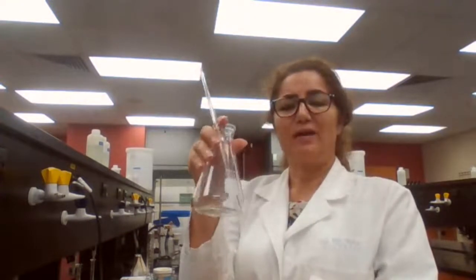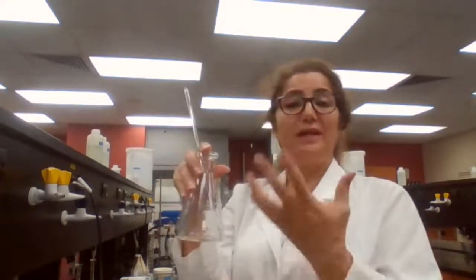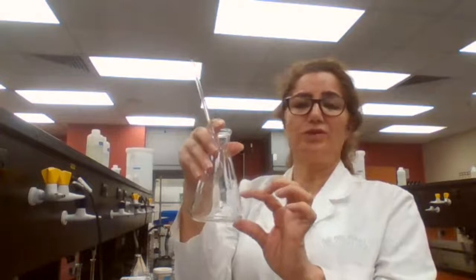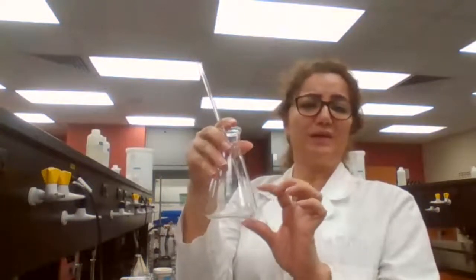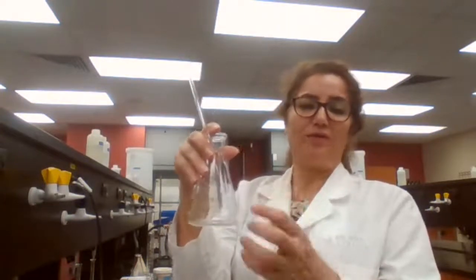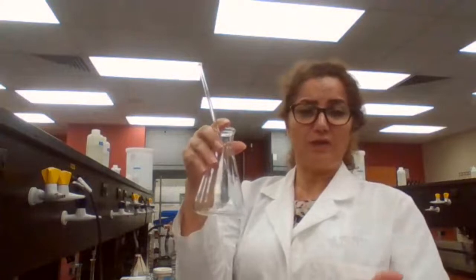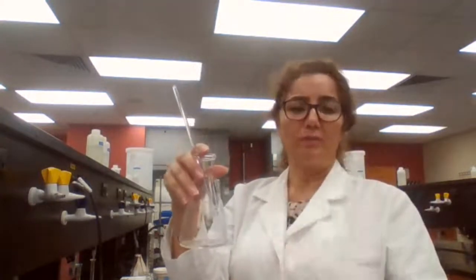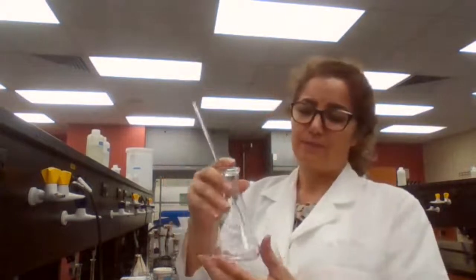How would you saturate the solution if it's unsaturated? You place it back on a hot plate and heat it up, and when you heat it long enough, you would reduce the volume in half. Your solution is going to be saturated, and when it is saturated, now you cool it down again to room temperature to get the initial crystals. Then you place it in ice for complete crystallization.